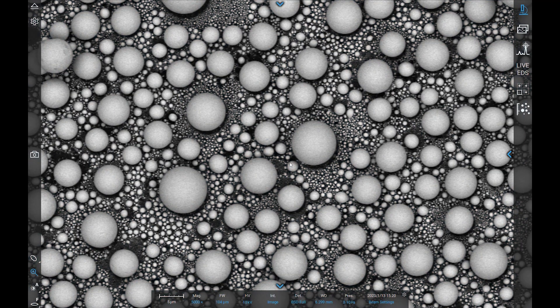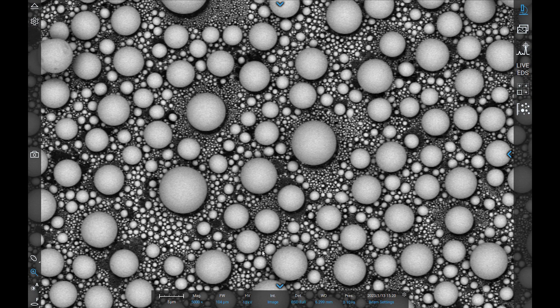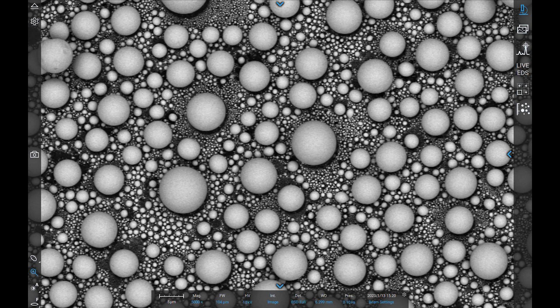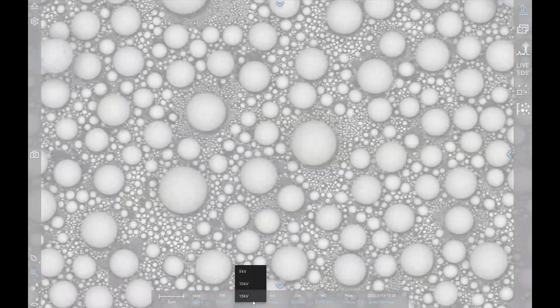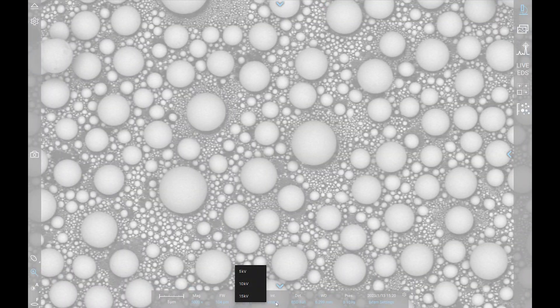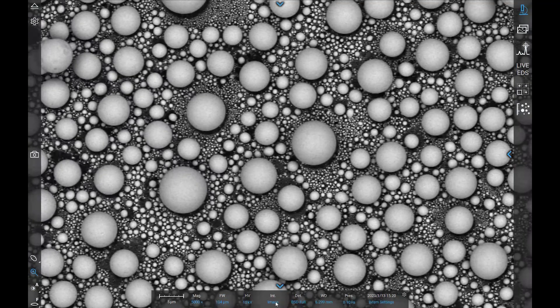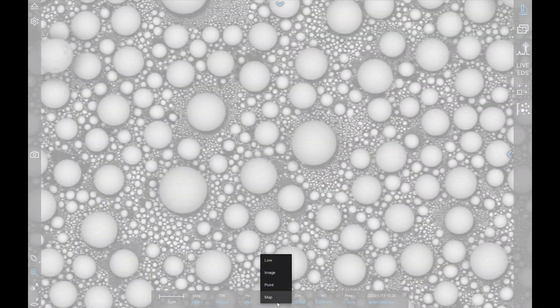You can adjust the beam settings from the data bar at the bottom of the screen by left clicking on the blue text and selecting which setting that you want. All the standard settings discussed in this video can be manipulated here.